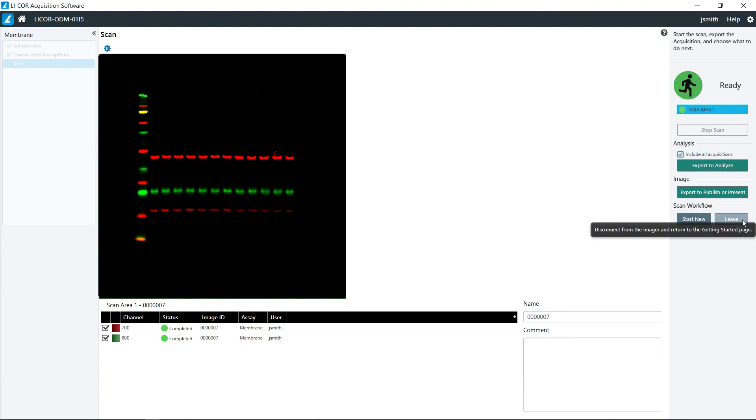Once you have completed your scans you can click leave, or if you have other scans to do you can click start new and then start over. Thank you.